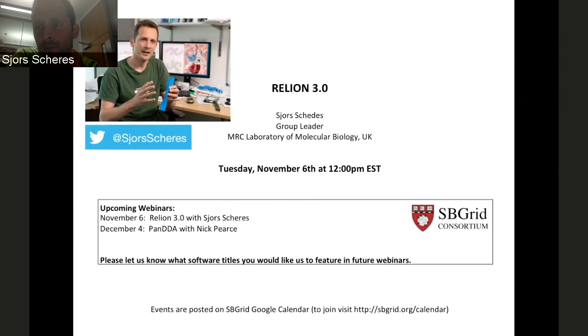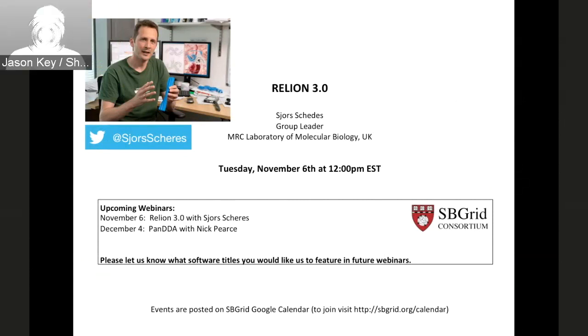Okay. Just taking off from that last question, I'm trying something similar with a virus, and I wanted to know how I could use particle subtraction on a symmetry expanded stack of refined virus particles, or should I just go back to refining the subtracted particles in C1?